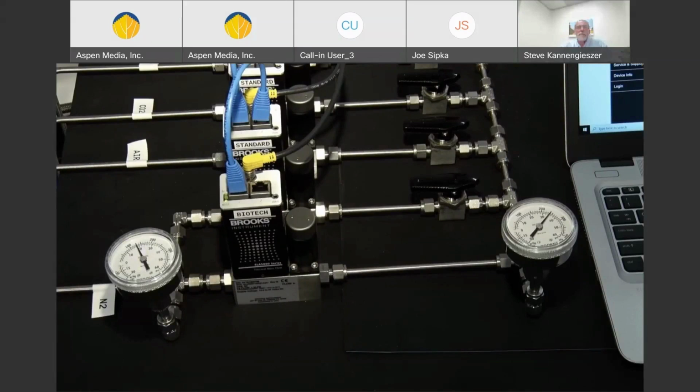Our recommendation is to build in mechanical fail-safes such as check valves to prevent backstream. However, a backstream could still occur due to a defective or missing check valve, and it's always a good idea to have some redundancy built into any critical system. Our recommendation is to build in these system precautions, but also configure an immediate process alert if this diagnostic appears. Service action is required, and in this state, it would fail a health check.